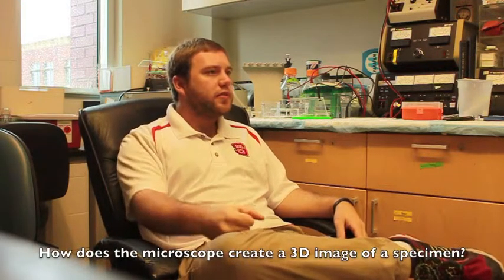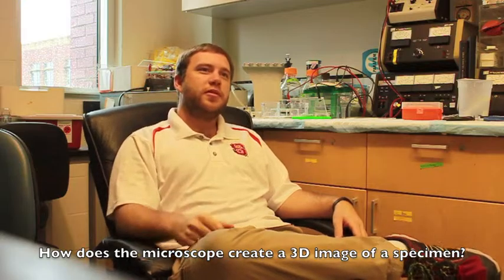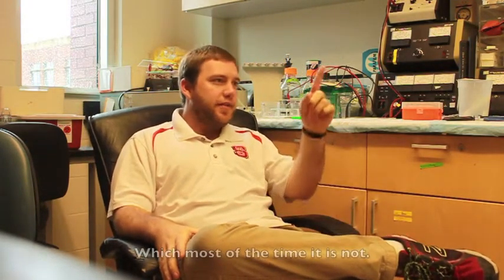What's the fourth dimension? You know this. Time. There you go. So the 3D is you have your 3D structure, so you're taking planes, you're collapsing them into a cube, and then you're doing that every 10 seconds over time. So all of a sudden you can say, okay, watch the entire cell change throughout time, if it's living.